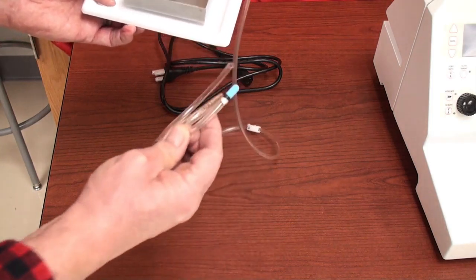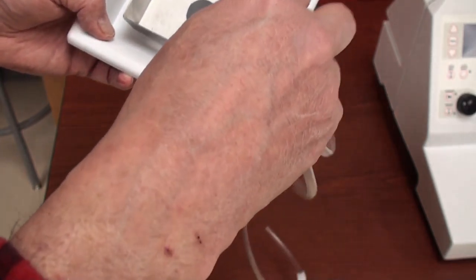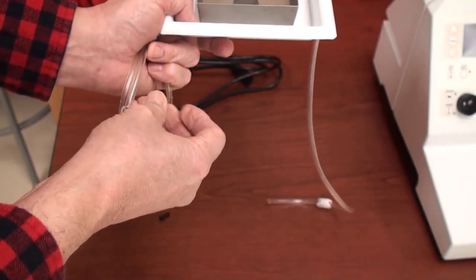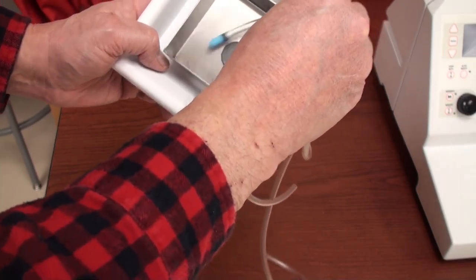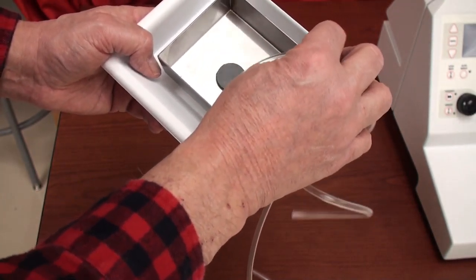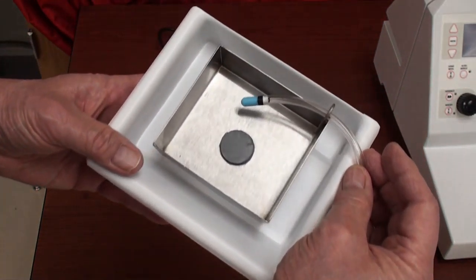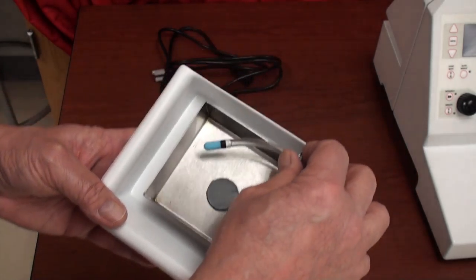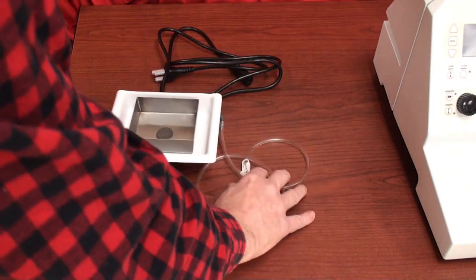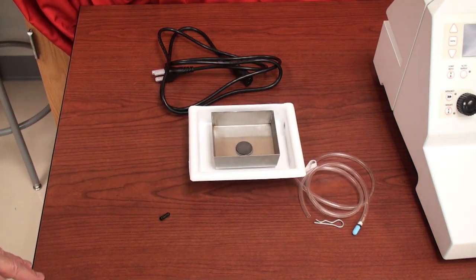This item is a bubbler, so you can attach this to the tray and have oxygen bubbled into your buffer solution. I'll show you how this all mounts on the instrument in another segment.